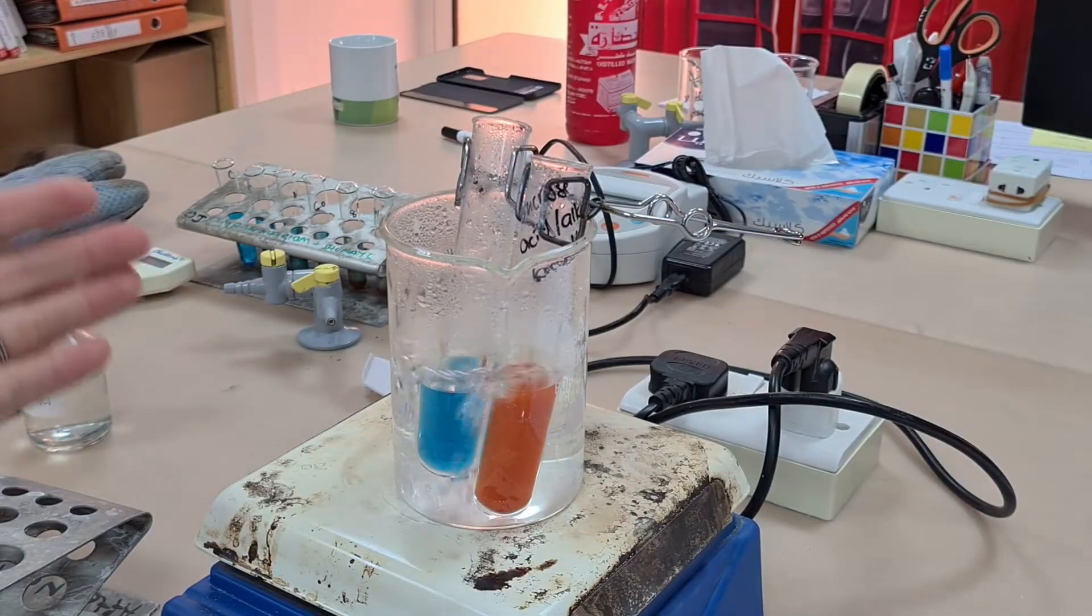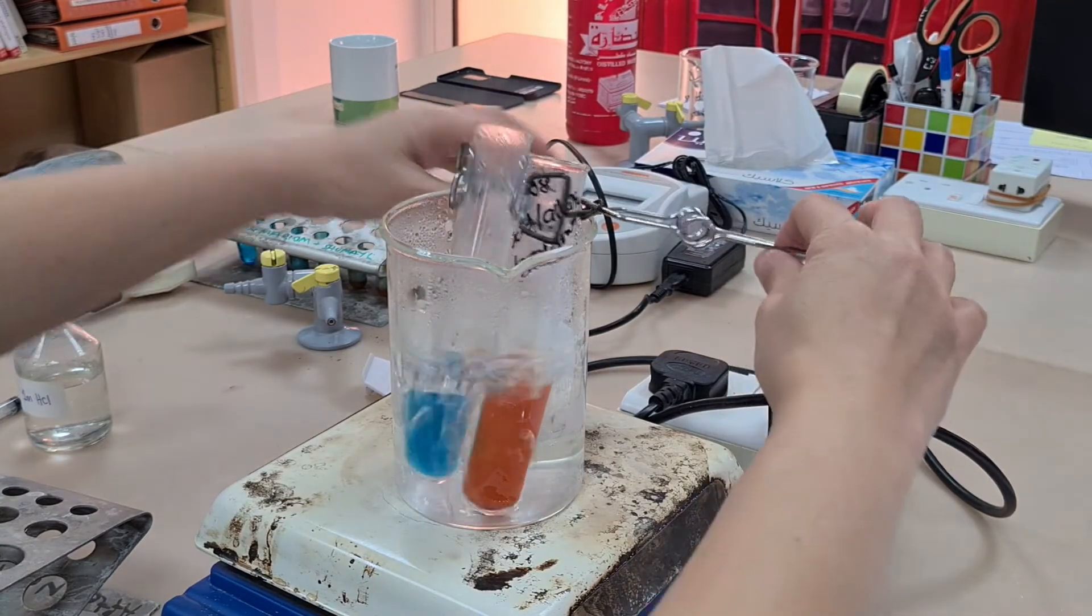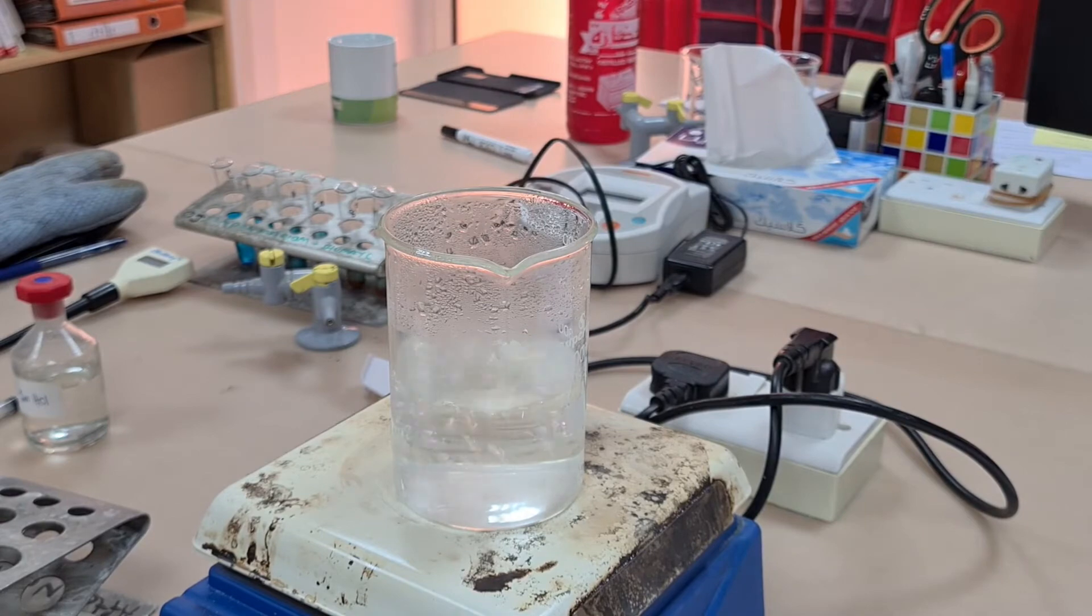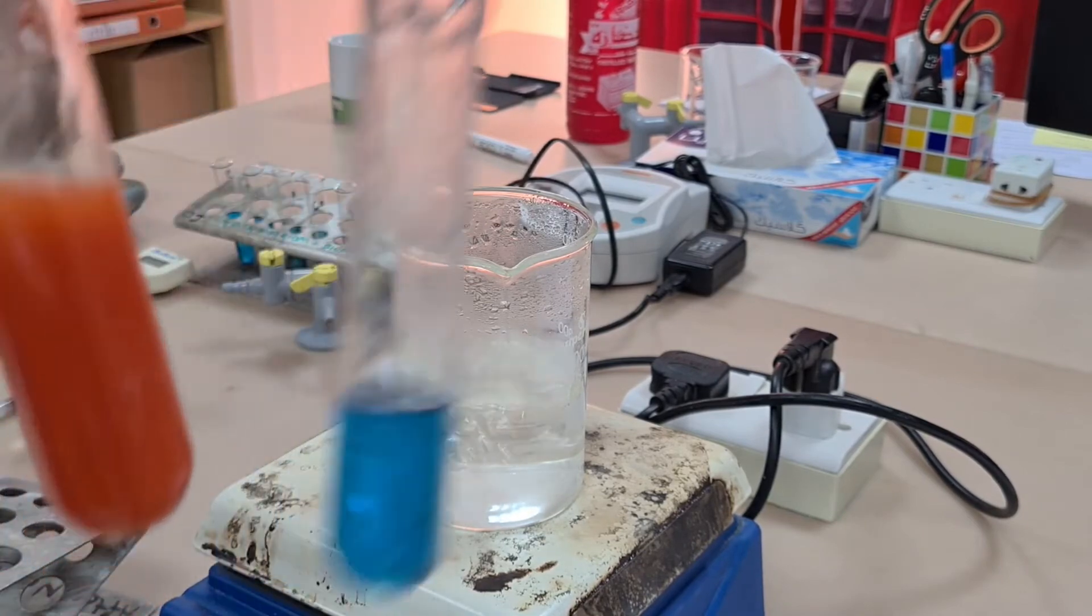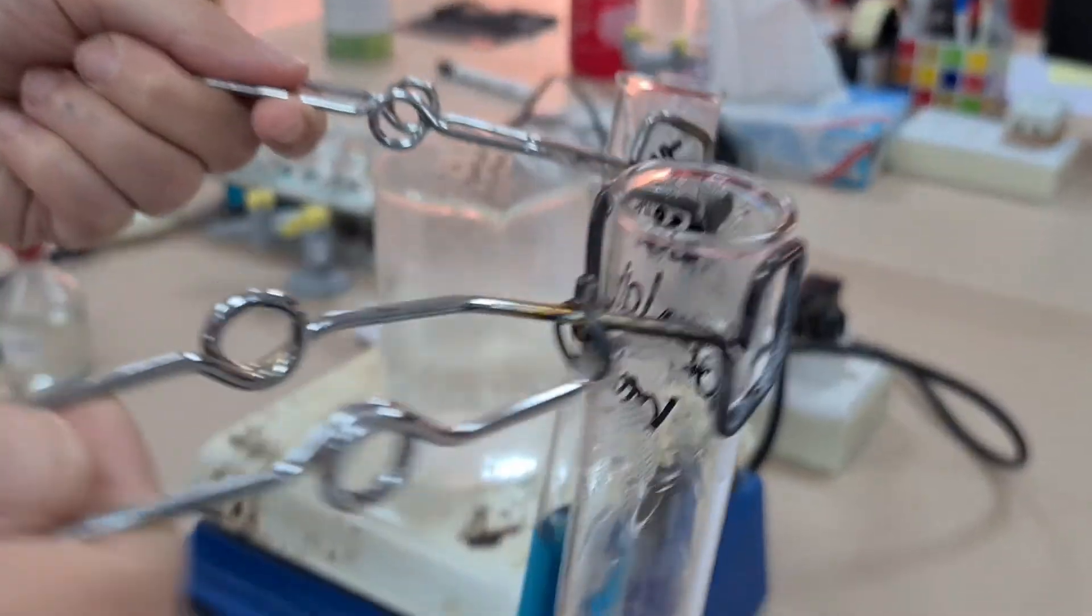However, the boiling tube on the right confirms we do have a disaccharide because it's been heated with acid which has broken the glycosidic bond down, resulting in two monosaccharides. Tested again with Benedict's reagent, we now have a positive result.